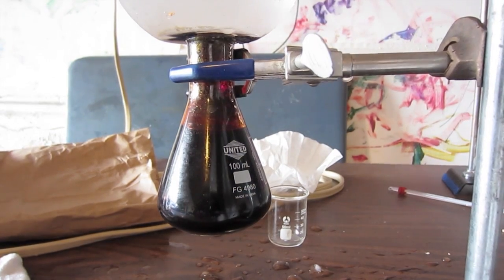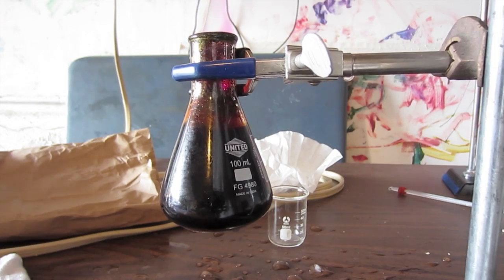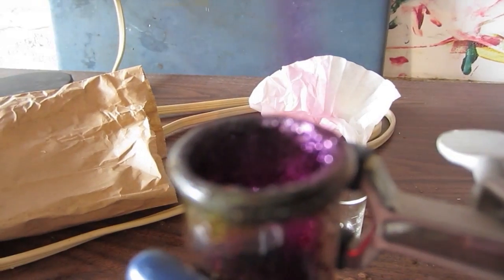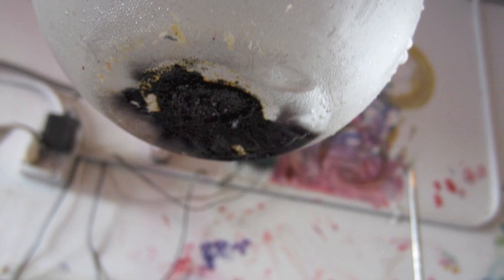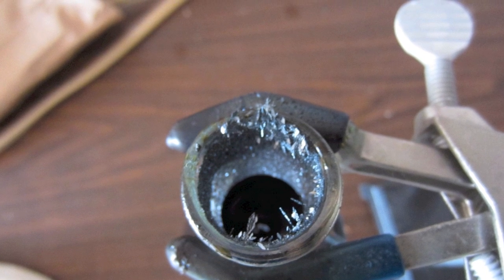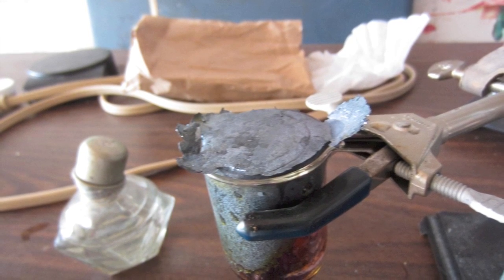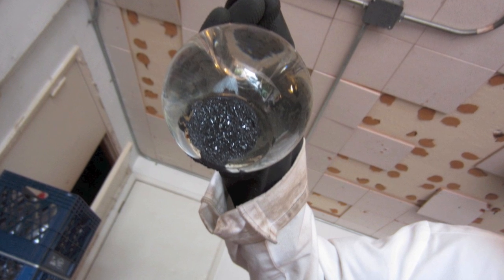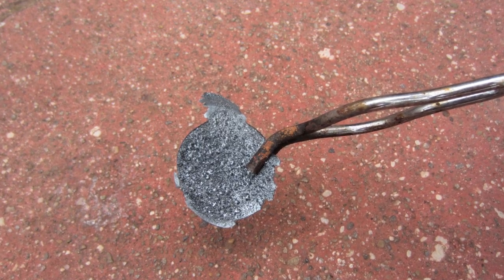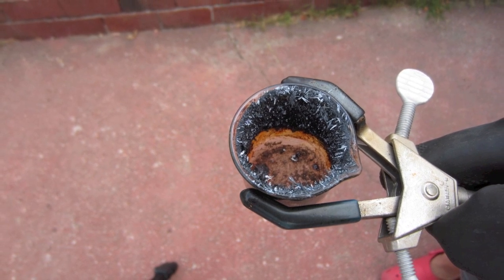Now I'm going to remove the top flask. You can see some really nice purple iodine vapor coming from the top of the flask and some iodine crystals on the flask. Here is what the iodine looks like when deposited on the bottom of the flask — there are some beautiful crystals on the neck of a beaker. Here is my main yield of iodine in a jar with nice crystal structure, and here are some really nice crystals on the edge of the beaker.